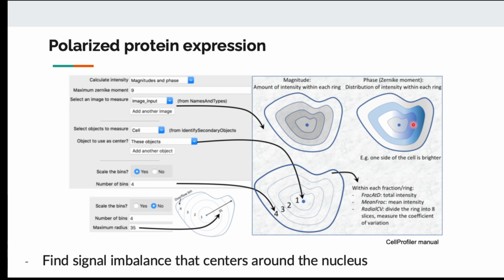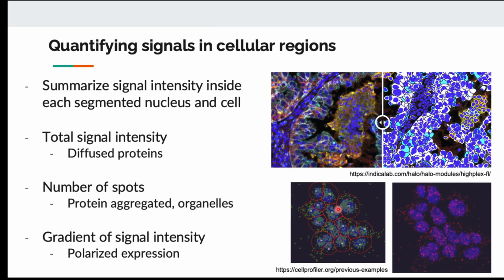So in this case, you can detect whether the expression of the protein is homogeneous across the whole cytoplasm, or whether there is a radial pattern from the center to the outward, or whether it is polarized, where one side has more expression than the other. These are patterns that algorithms can detect in the image based on these fluorescence signals.